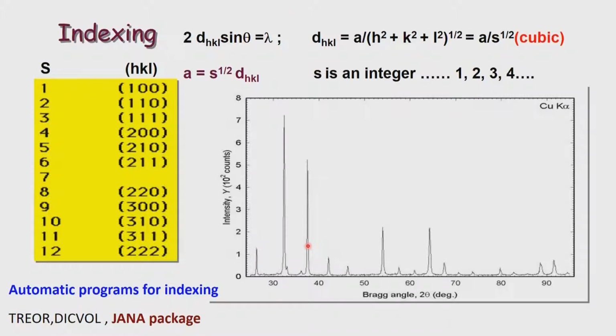So, whatever be the crystal system, in principle, following this methodology which we mentioned, we can determine the unit cell dimensions. Having determined the unit cell dimensions, what are the questions we come across in X-ray? We already discussed what is the content of the XRD pattern, in a powder XRD pattern. So, I thought I will highlight the uses that are relevant in the pharmaceutical industry, and also in general chemistry.